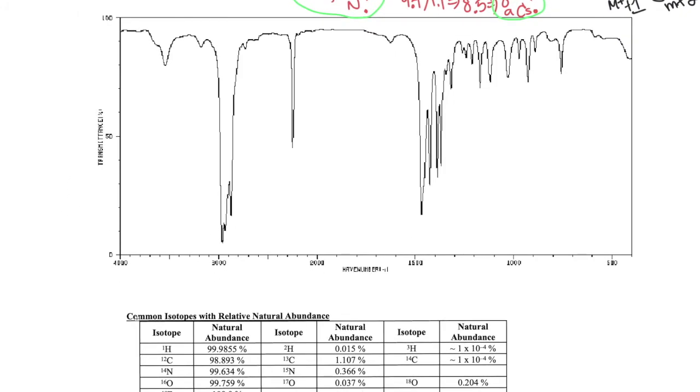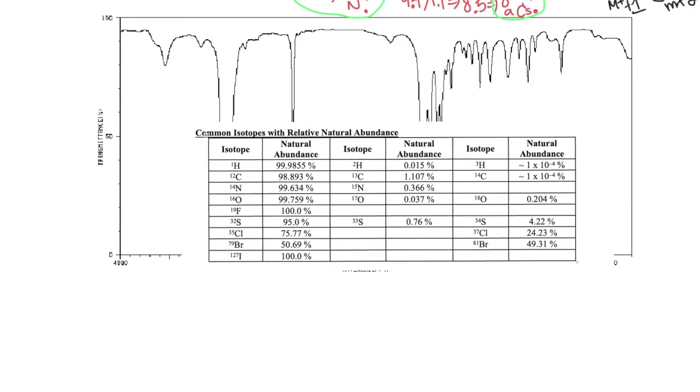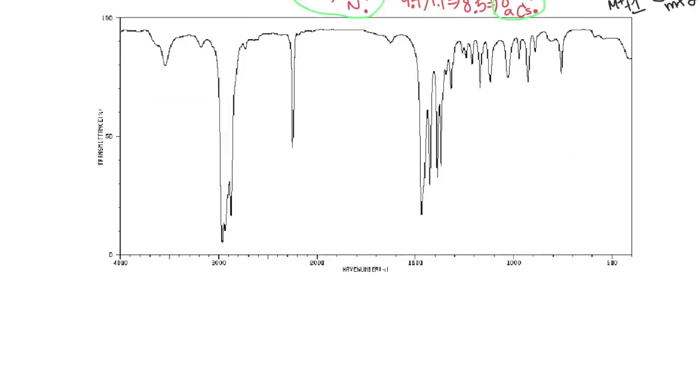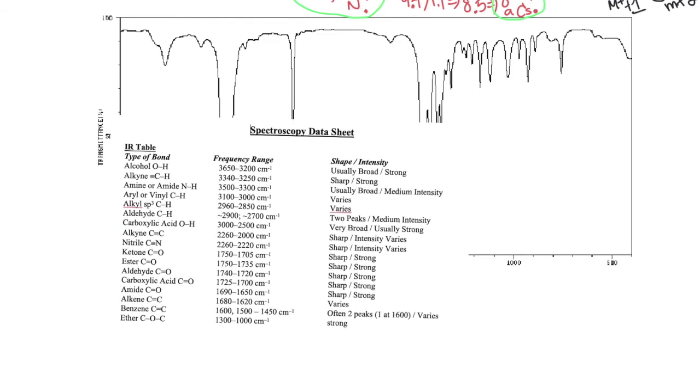Now, I'm going to move this back up. This is our reference. I'm going to pull down the other thing from that same data sheet. We want to not forget some peaks that might be helpful. Remember, we're looking for CN groups and CCl. And CCl is not on there. It doesn't give a very significant IR absorption. But CN, what kinds of CN groups should we look for?